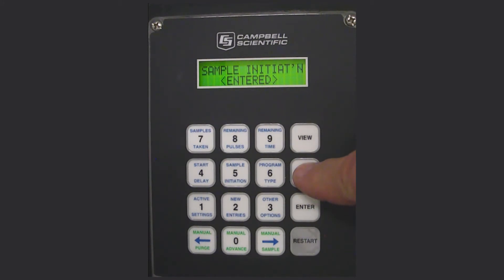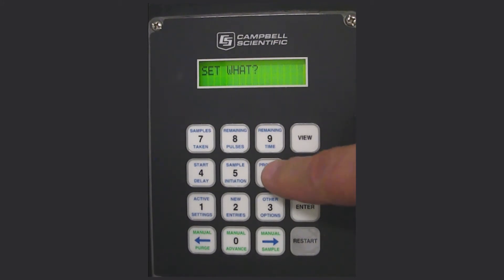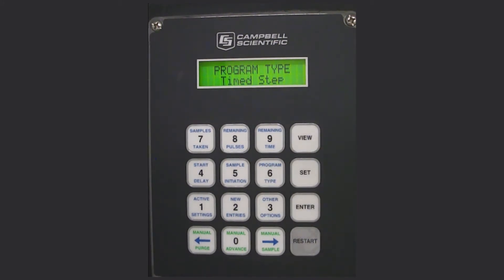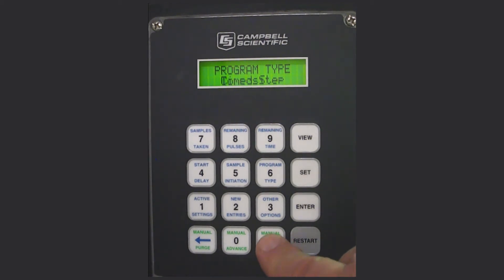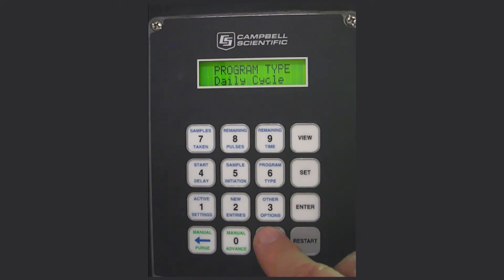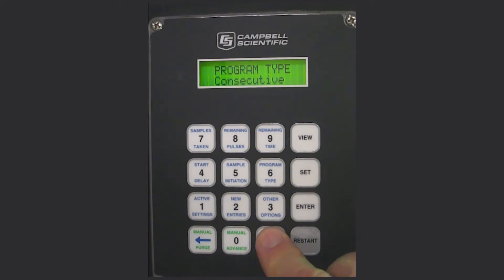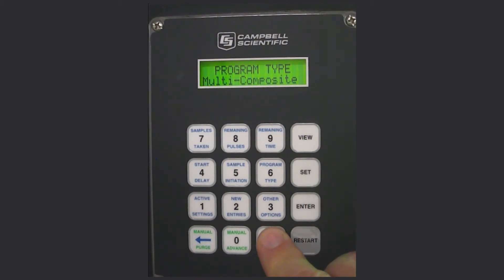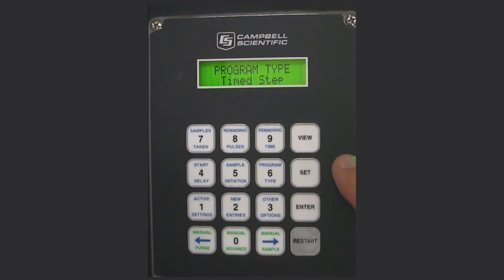Then go to set program type. In this case we're looking for time step. Right arrowing through the options you'll see this is a composite sampler with options including daily cycle, consecutive, multi composite, or in this case we're going to be doing a time step.